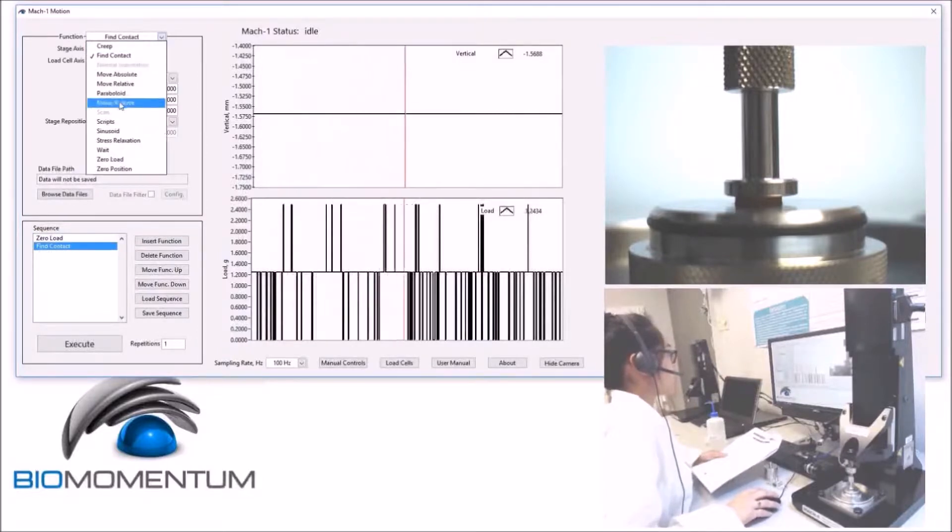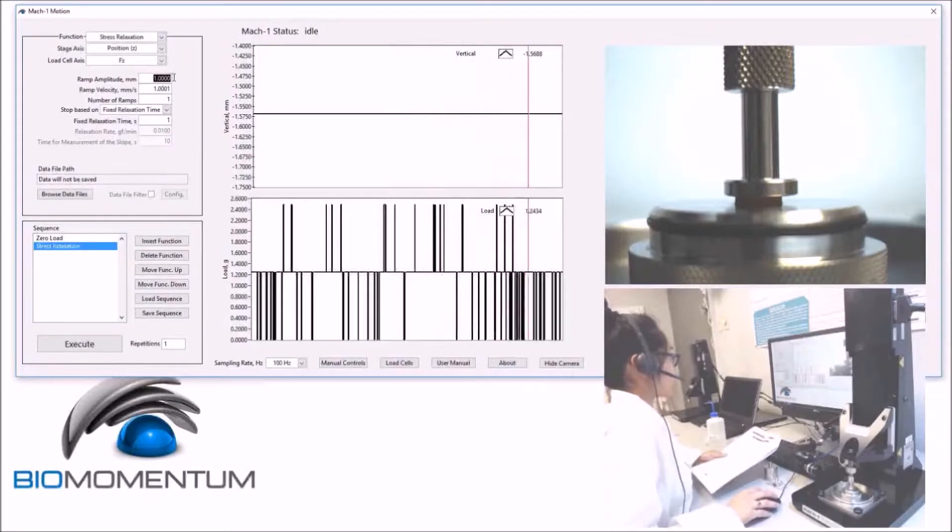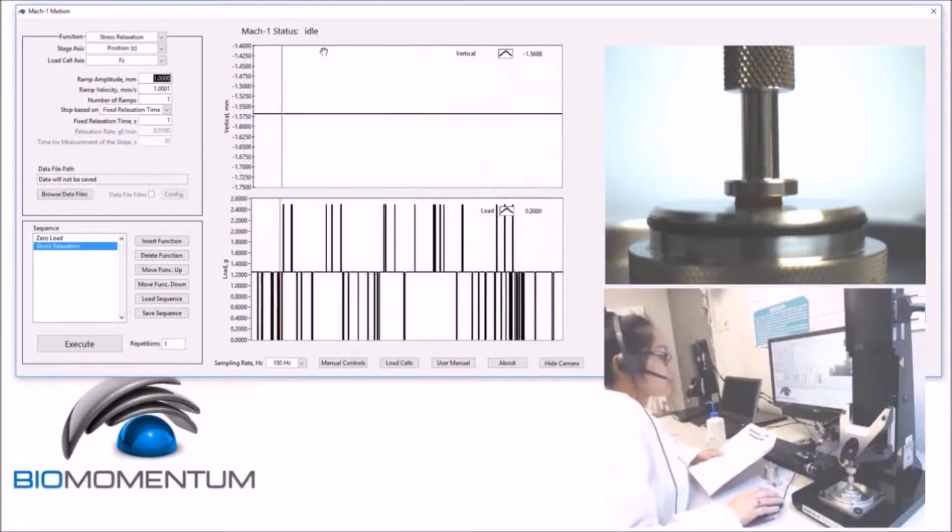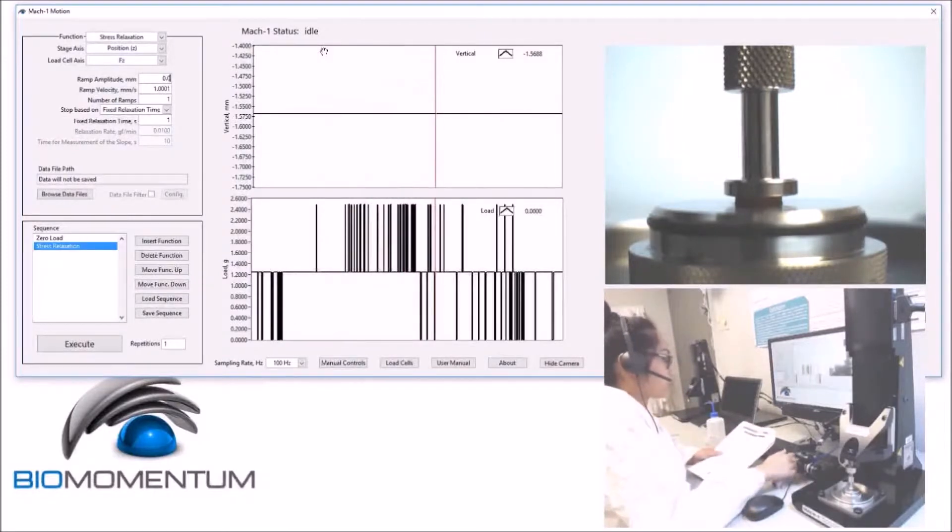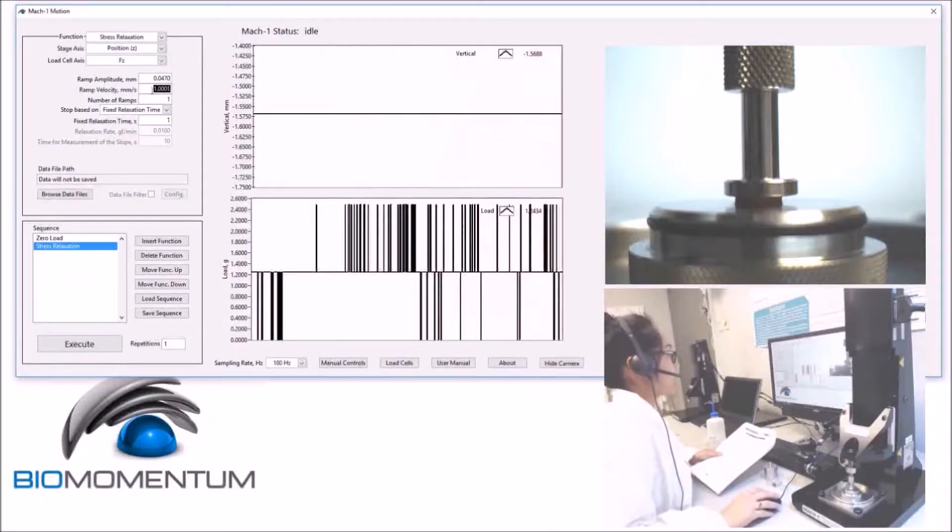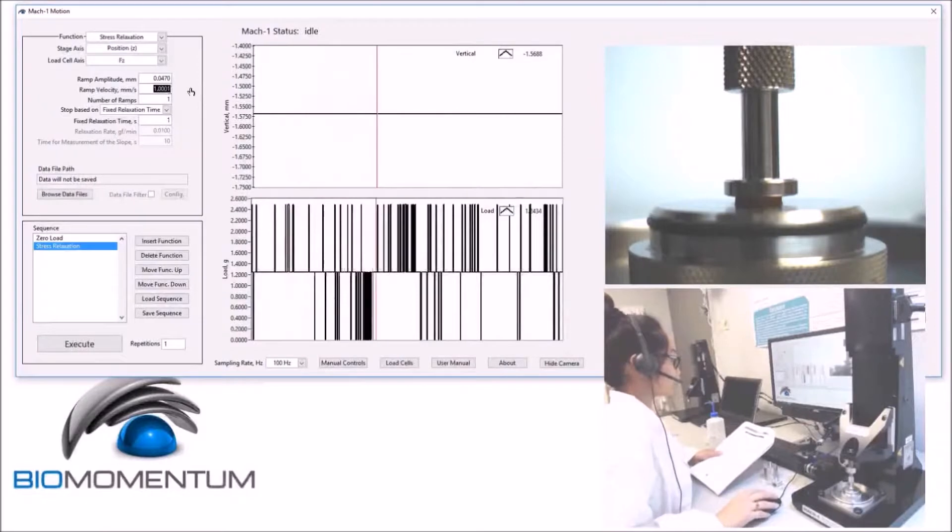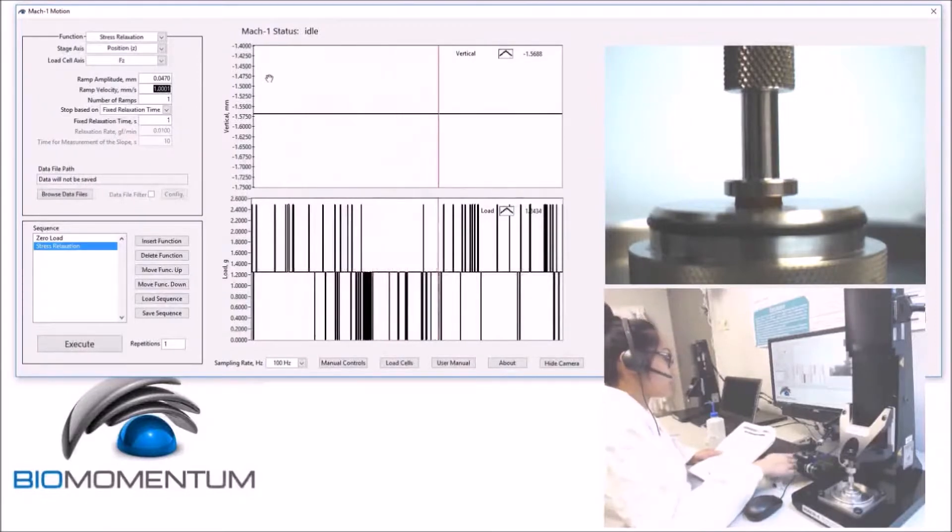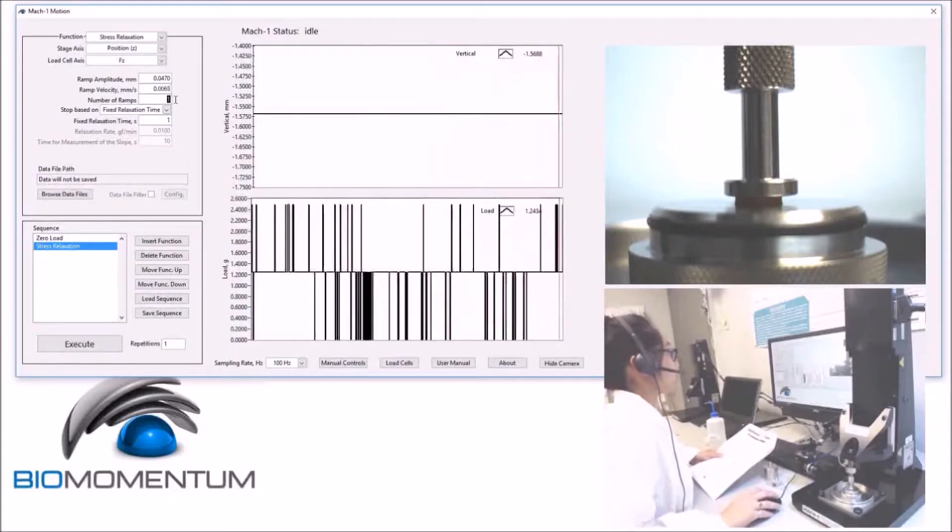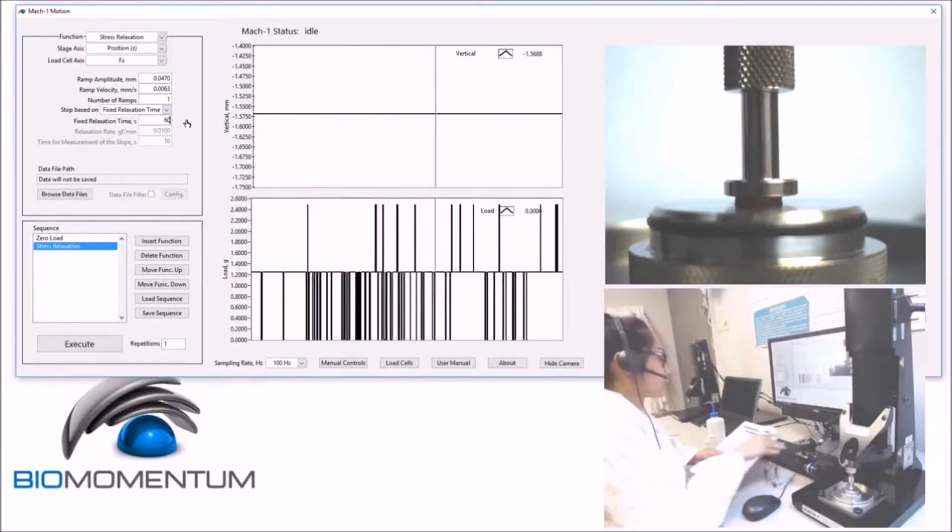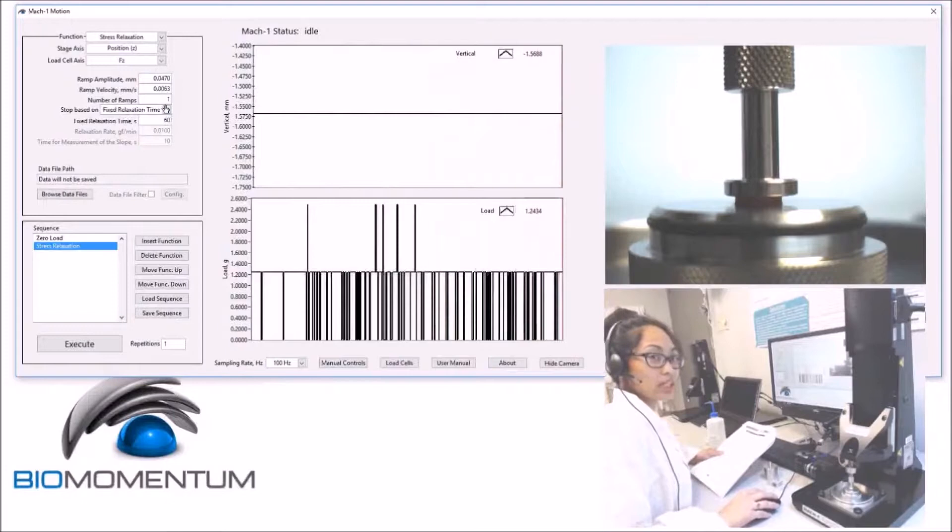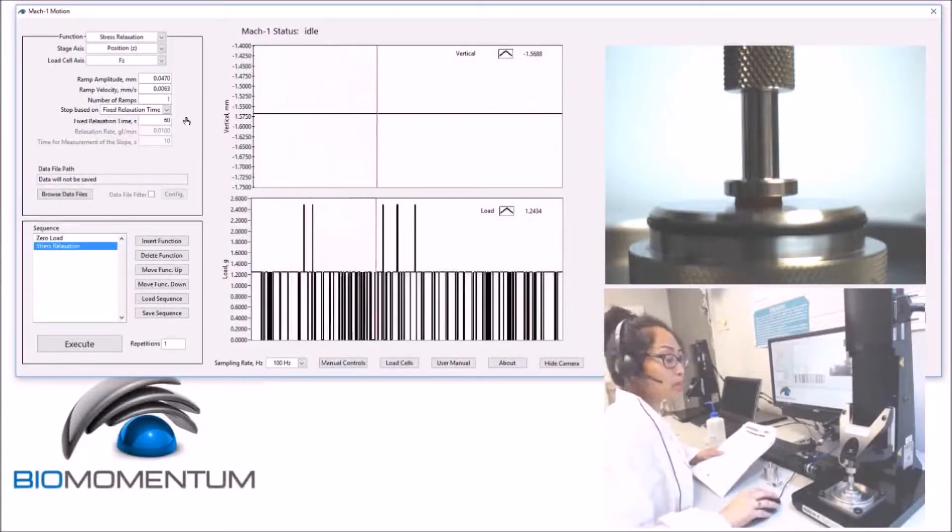followed by a stress relaxation with an amplitude of 3% of the sample thickness, which results in 0.047 mm and at a speed of 0.4% strain rate, which results in 0.0063. We will perform one ramp using a fixed relaxation time of 60 seconds. This stress relaxation consists of a pre-compression of the sample.